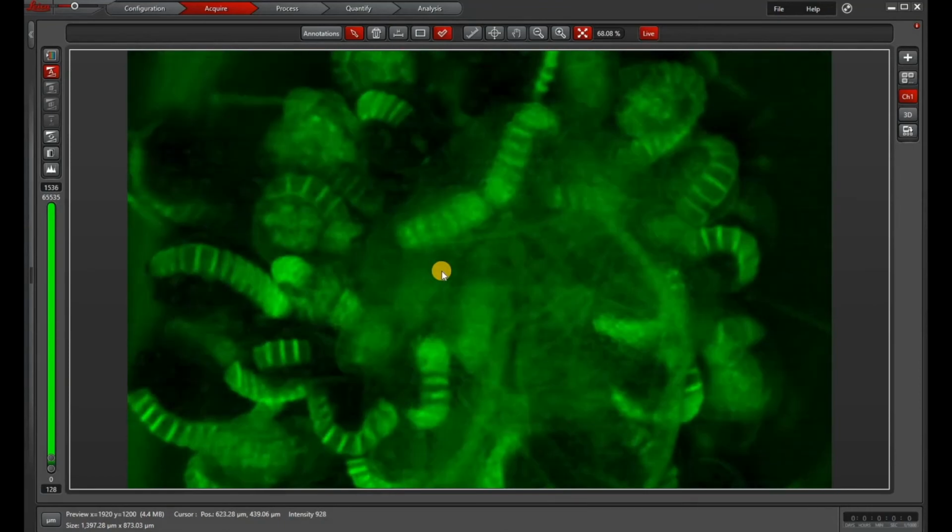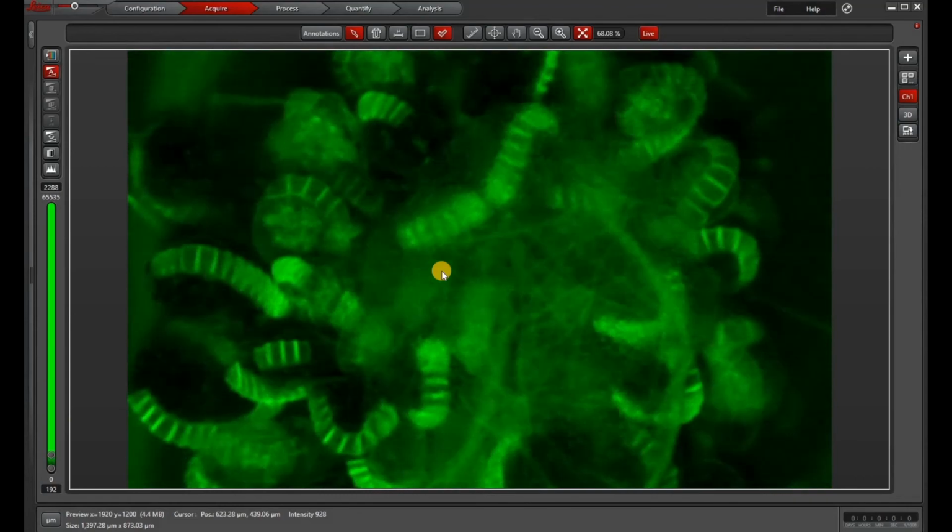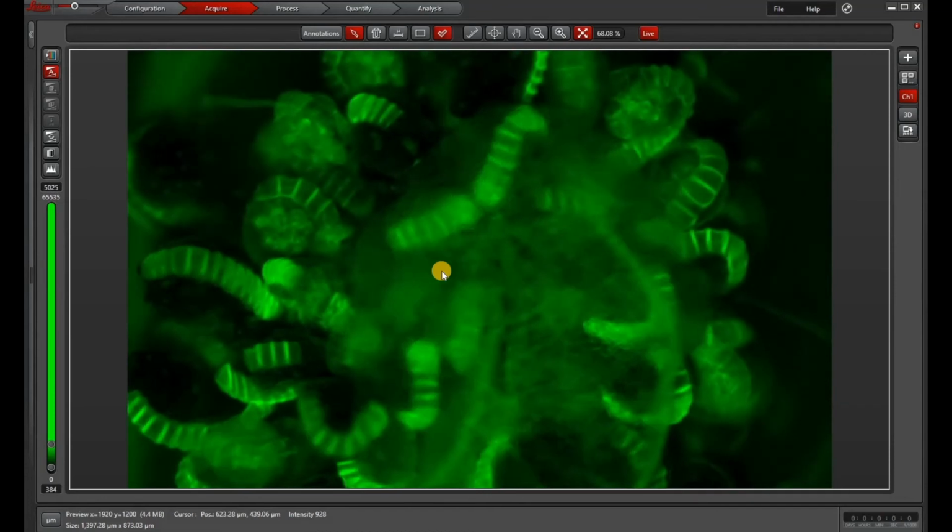So you're going to have to trust me that I was closing the iris diaphragm, and you can see the intensity going way down and then coming back up again as you watch this bar on the left, because right now I have it on auto scale, so you can't really tell as much.